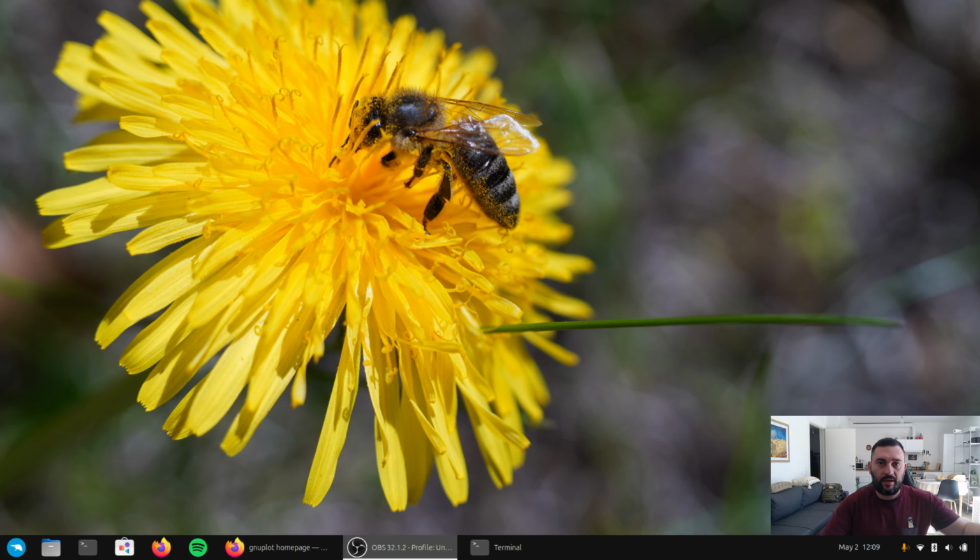I have a miniRaman device which is attached to the computer with a USB cable, and a polystyrene sample attached to the device. It is a reference polystyrene sample from Lightnovo.